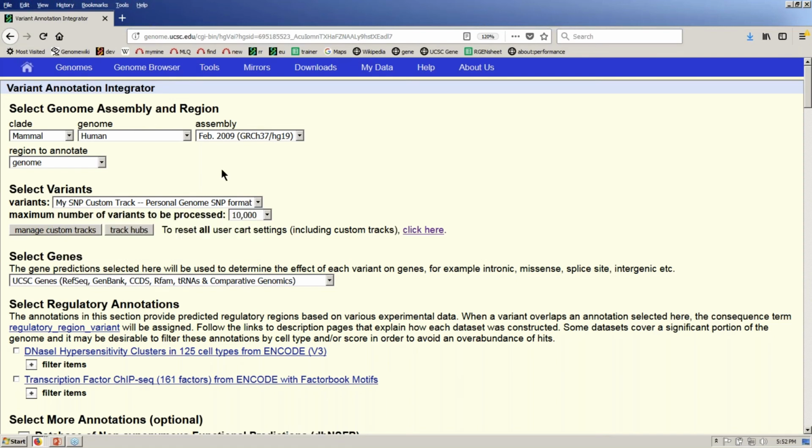If you come here without any tracks loaded, then you can still play with it a little bit using those artificial examples. You can also load variants in as HGVS or rsIDs, variant identifiers, and so you can see what the variants are. If they have an rsID in dbSNP, you can load them in a file or paste them in there.